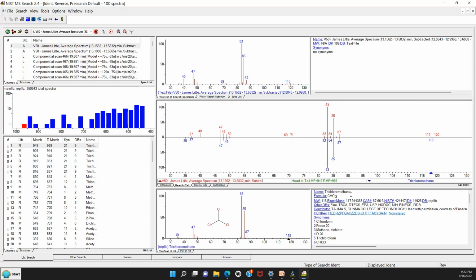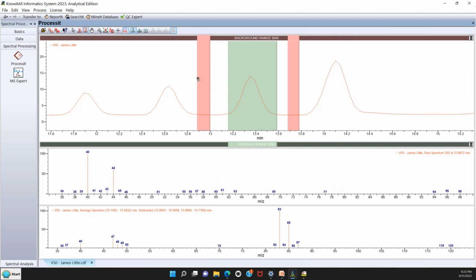So now if you want to go back to get another spectrum, there is an arrow, if you look up at the top here, called Switch to Caller, and it knows how to go back to the program that sent it the spectrum. So you just go back, and now you're ready to get another spectrum.